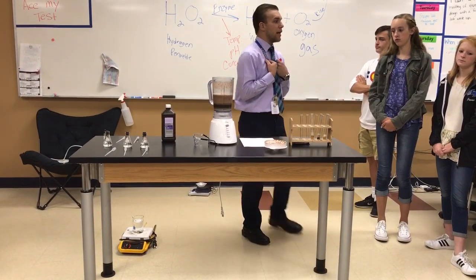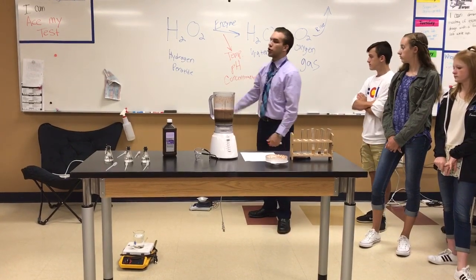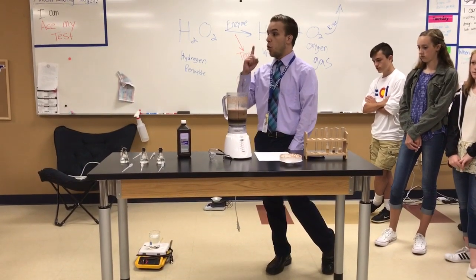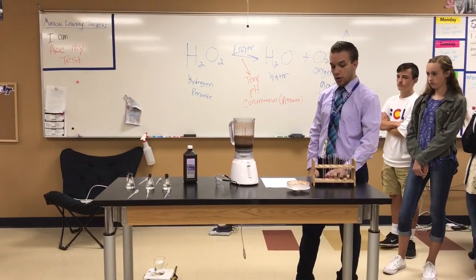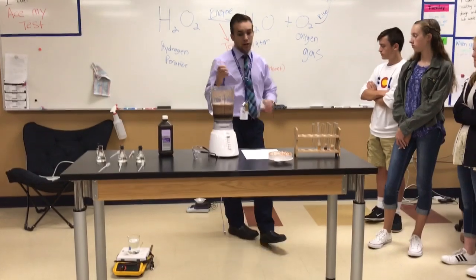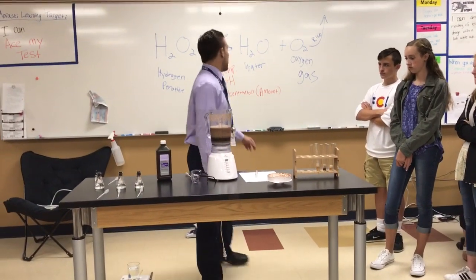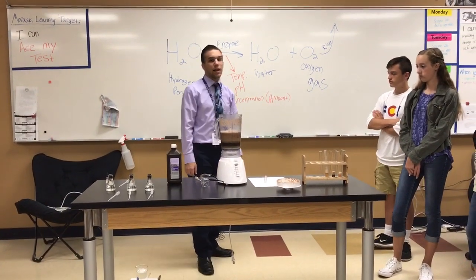Right now I'm going to pretend my experiment is looking at changing the temperature of the reaction, just to give you guys a demo. Because remember, when we do an experiment, how many things are we allowed to change at a time? One. So we're going to focus on temperature. The first thing I'm going to do is take this test tube and get some enzyme in there — I've got to get some potato out. There are a couple of different ways we can measure the amount of potato that goes in. Because if we're only changing the temperature, we need to think about our constants — things that need to be kept the same.